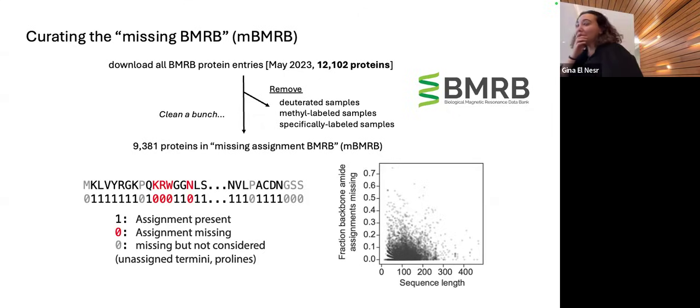Back to this assumption, right? The way that chemical exchange works is that when it's in two different chemical environments, the peaks are at two different positions as it gets broadened out. But let's consider a hypothetical case where I have a beta strand that's doing absolutely nothing, absolutely stable, and an alpha helix that's moving out. The beta strand, which is doing absolutely nothing.